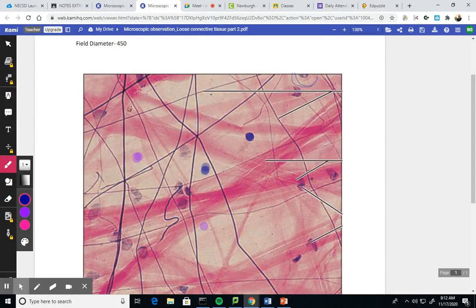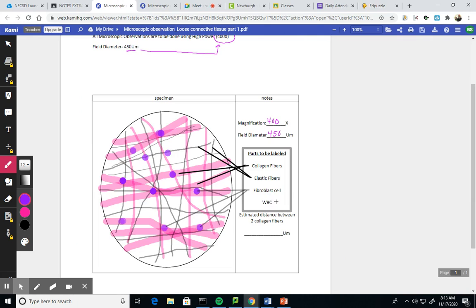But they look different because if you were to draw a white blood cell, the whole cell would be kind of light. And the inside, there would be a defined nucleus that would be darker, right? I don't really see that with these other ones. I kind of see that here up at the top, but this would be like what a larger white blood cell would look like. But you know what? If I don't see it, I'm not going to draw it. I'm just going to eliminate that.